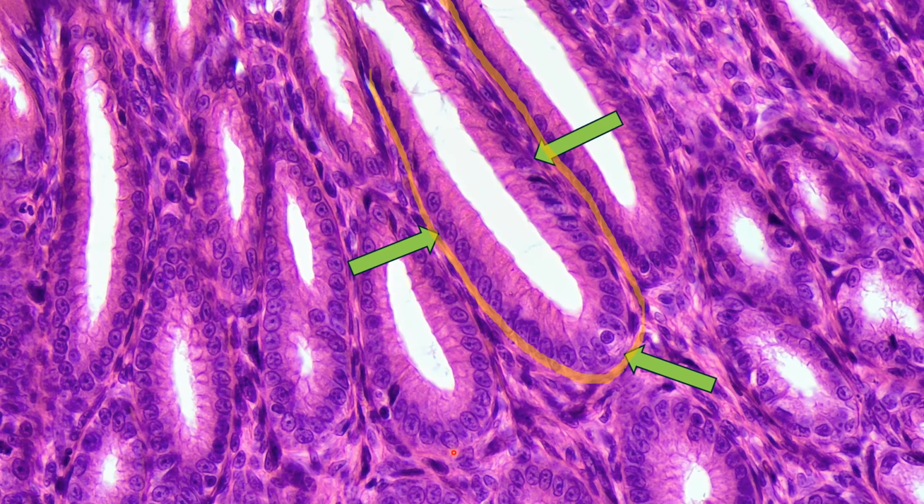So there roughly is our basement membrane. We have a lumen here in the middle. This is coming from the stomach. Now, you could see there's individual nuclei here that border the bottom part along that basement membrane.